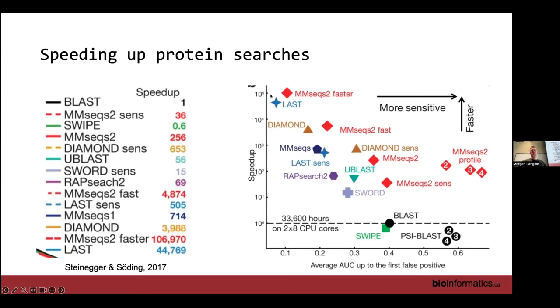The other tool I want to mention here is more local based, in that you install the system on your laptop, and the visualization is done there. It is MEGAN. MEGAN has been around forever. It was one of the very first microbiome tools ever, and I'm amazed that they keep pumping out new versions and it is still quite widely used.